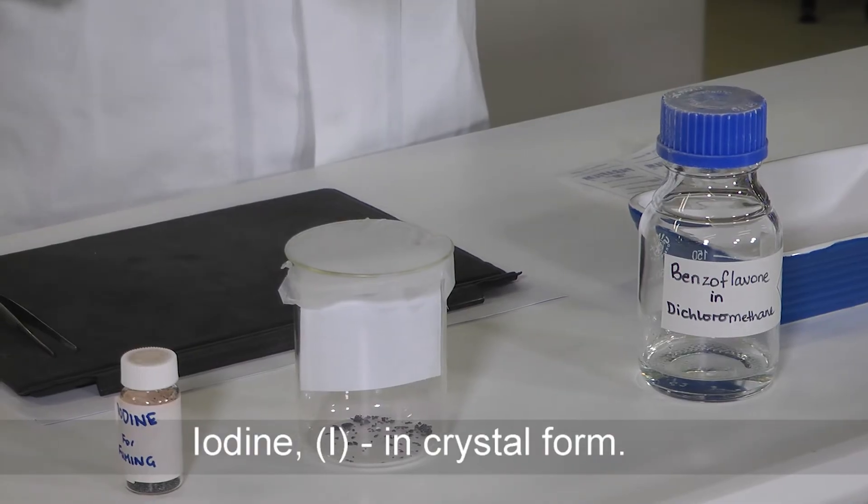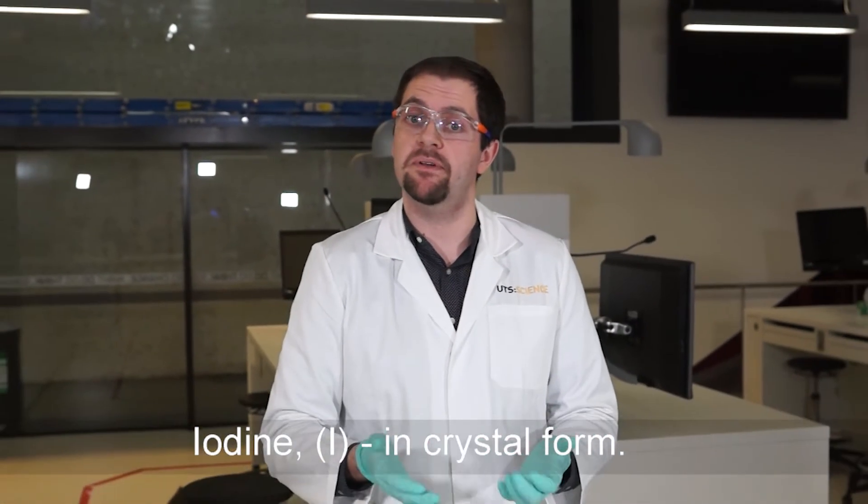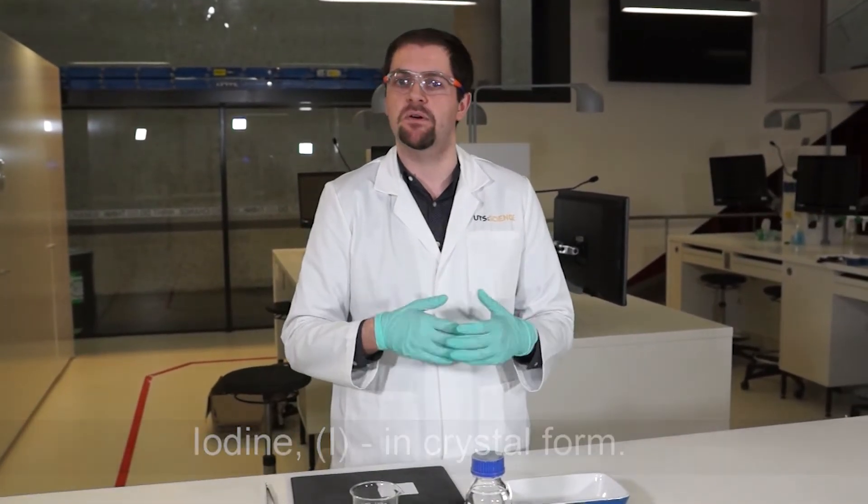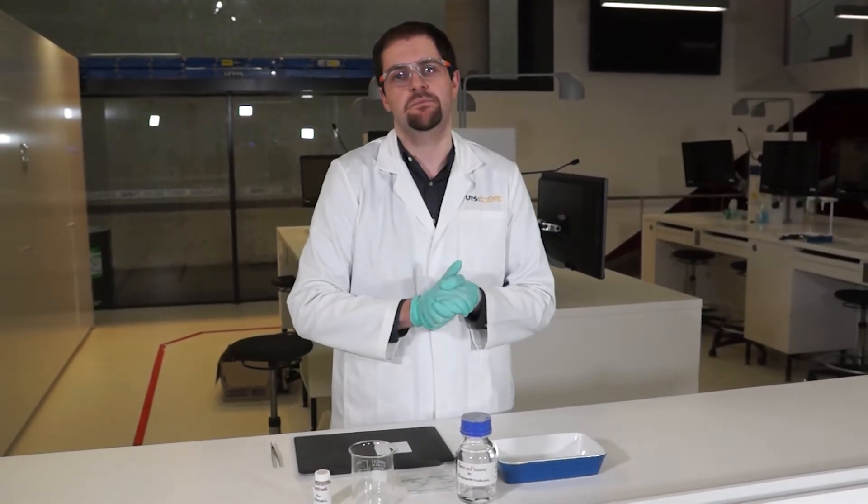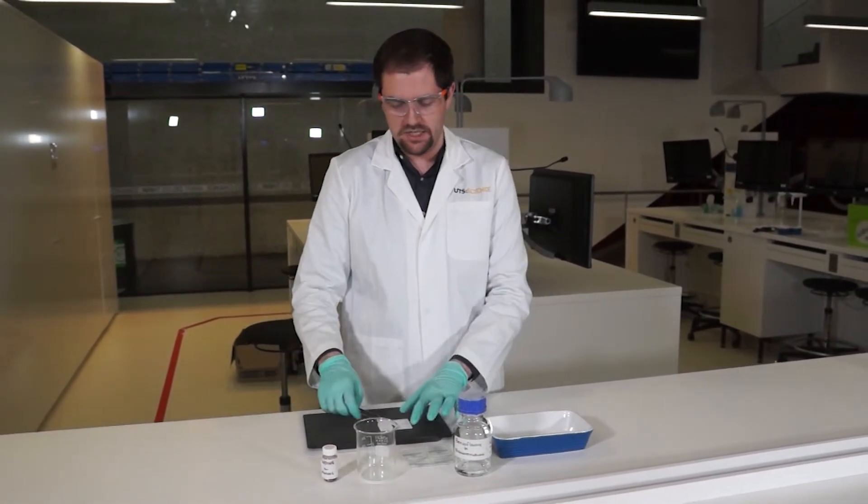What we have here is iodine, which is a solid at room temperature. We can expose a piece of paper that has some fingerprints on it to the iodine solid, and what will happen is the iodine vapor will fume and give us some nice brown finger marks where we've deposited some fingerprints.